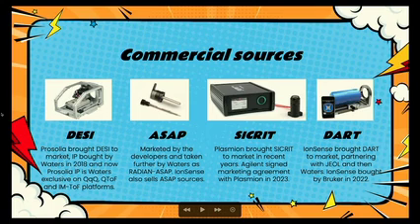Fits in, replaces the probe in their standard Z-spray ESI source. Has now since come to market in the last 3 or so years as the Radian ASAP, which is their single quadrupole instrument, and makes a really nice, rapid unit resolution screening instrument, sort of step beyond spectroscopy as a nice screening instrument.